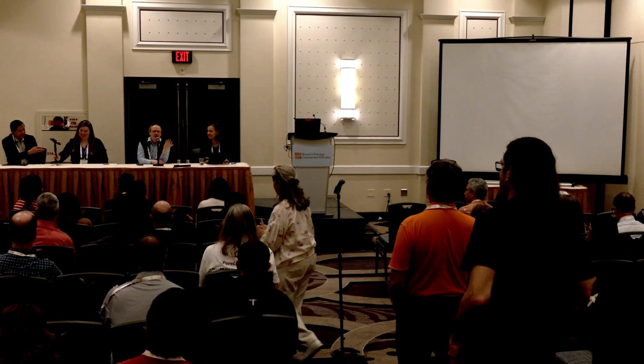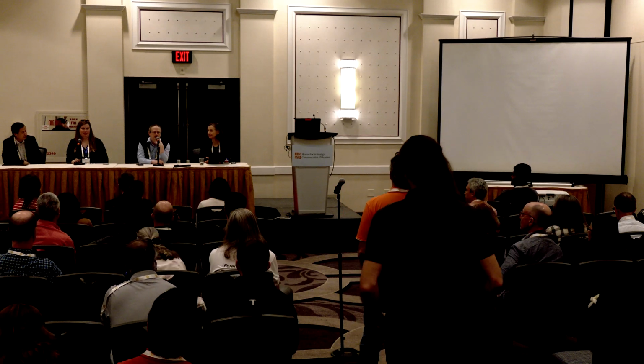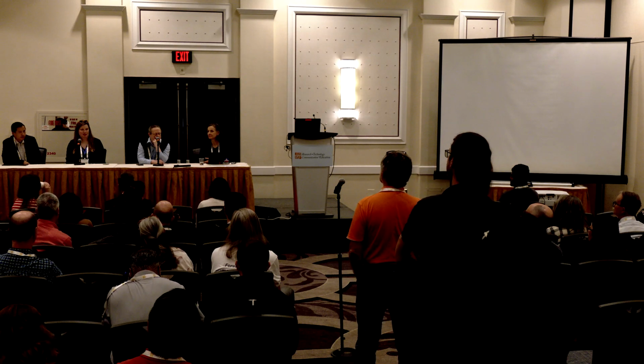Again, look, there's a reward for the graduate student themselves who's left 5 years ago. That's the tough part. So what we've done, the way I think about this with our stuff is, I think data harmonization and data provenance are the enemies of each other. There's a real clash between harmonization and provenance.